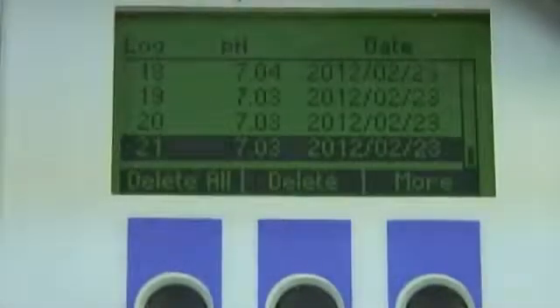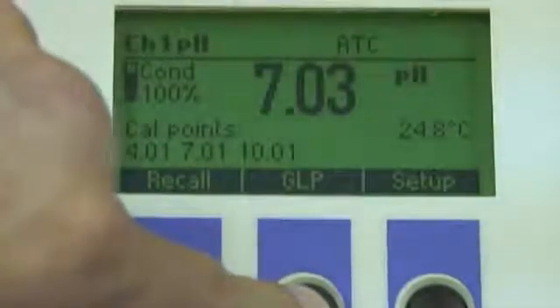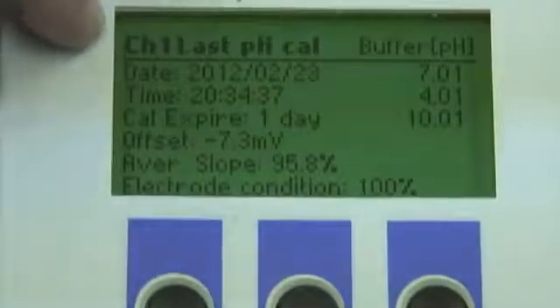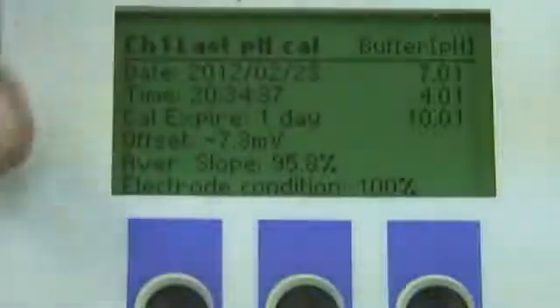Let's escape out of this and take a look at GLP, which stands for Good Lab Practices. This is information based on the last time the probe was calibrated. Here we see the date, the time, the offset, the slope, and the buffers that were used.